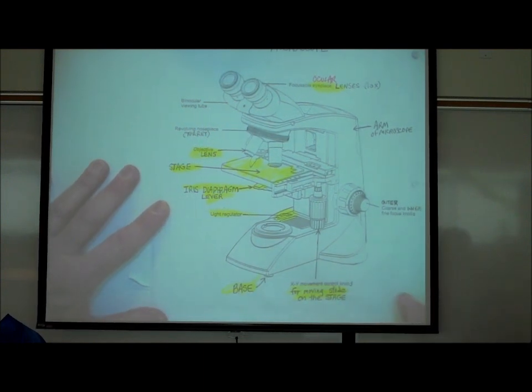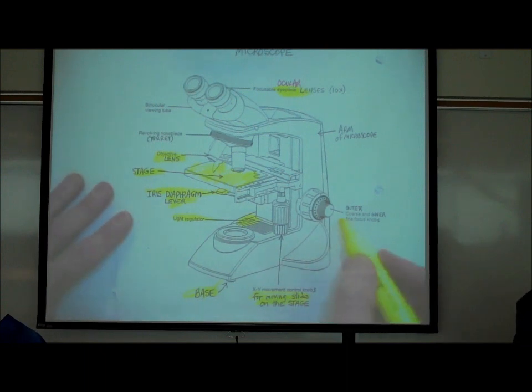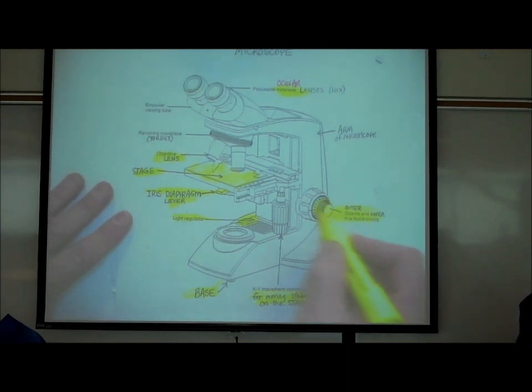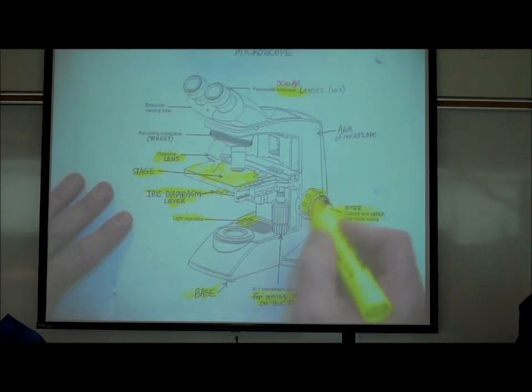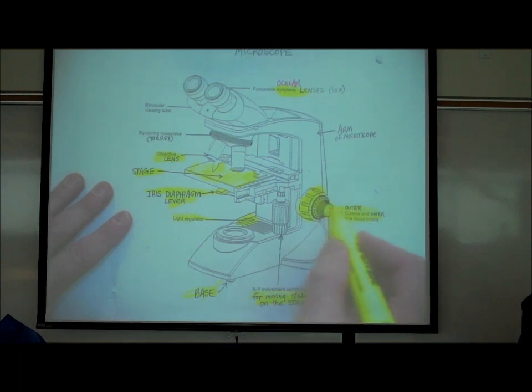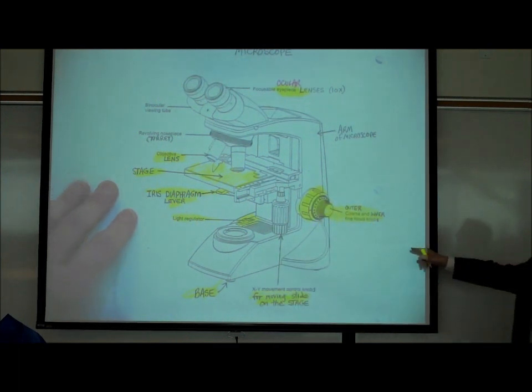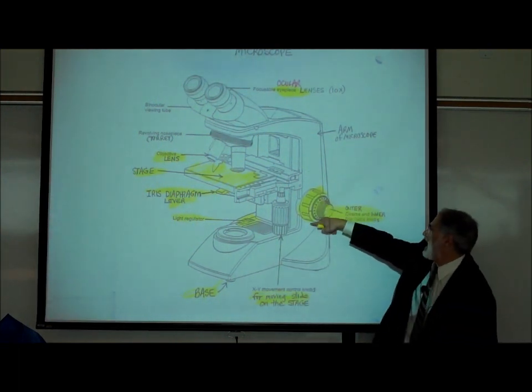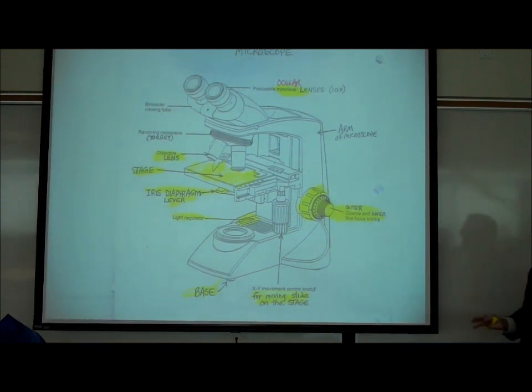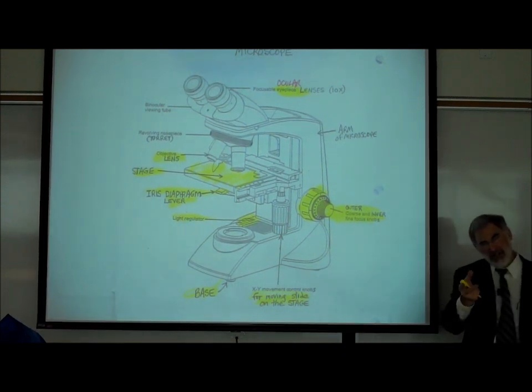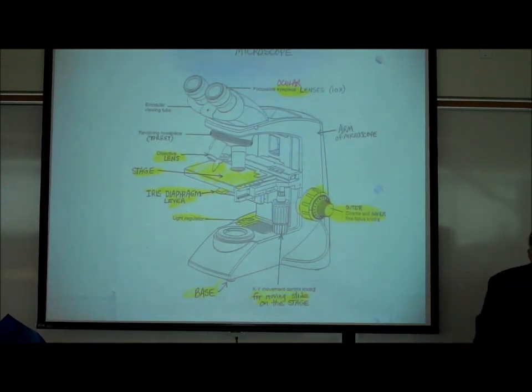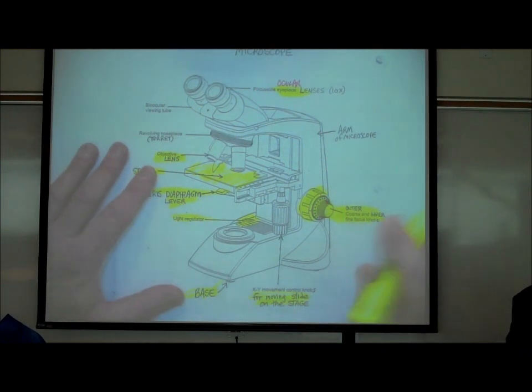The focusing knobs are right here. There's an outer coarse focusing knob for gross or general focusing, and an inner fine focusing knob for fine tuning.